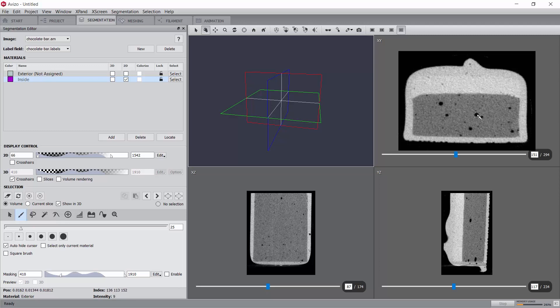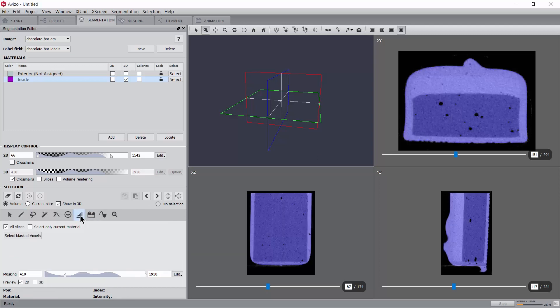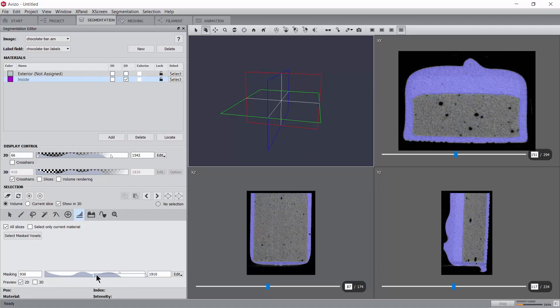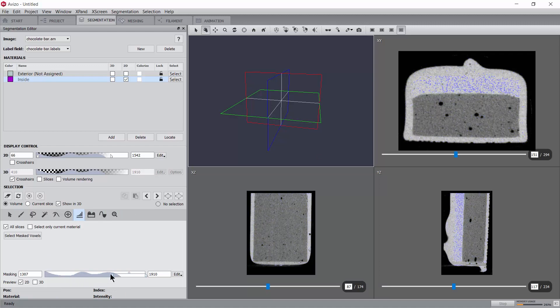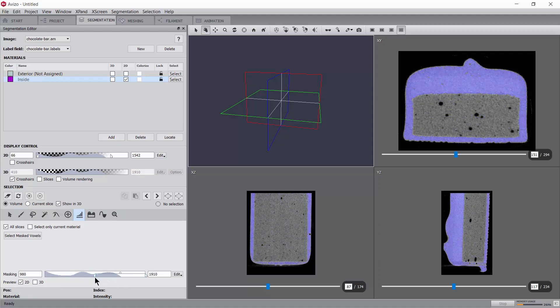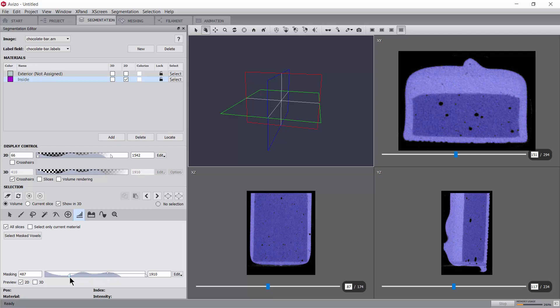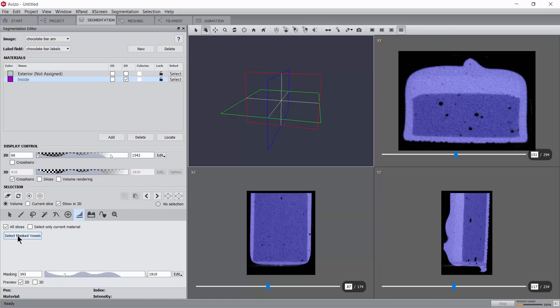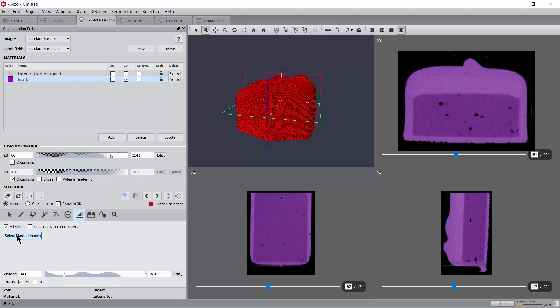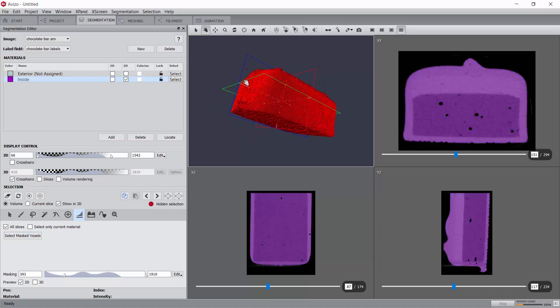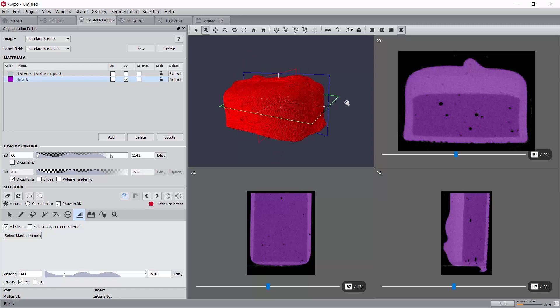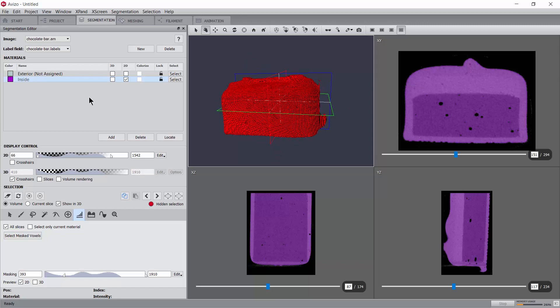Let's start with a simple threshold. Select the threshold tool from the selection area of the segmentation editor's main panel. Adjust the masking range such that the blue mask includes the whole chocolate bar. Once a reasonable masking range is selected, let's then press select mask voxel to perform the selection. Then select the target material and add the selection to that material.